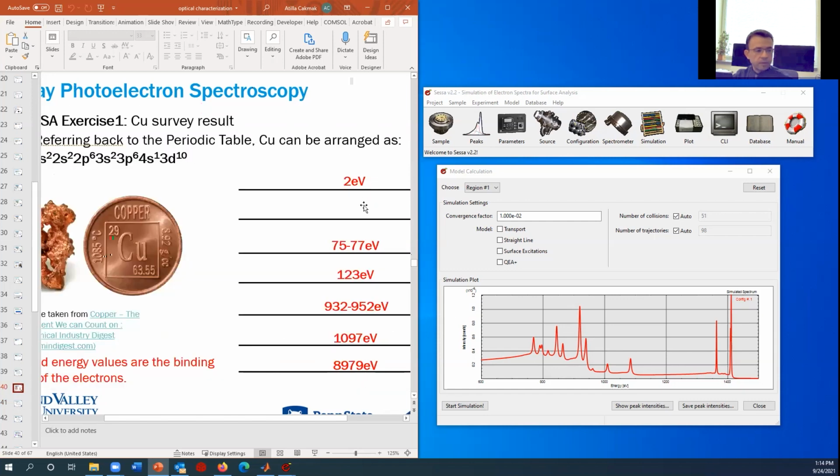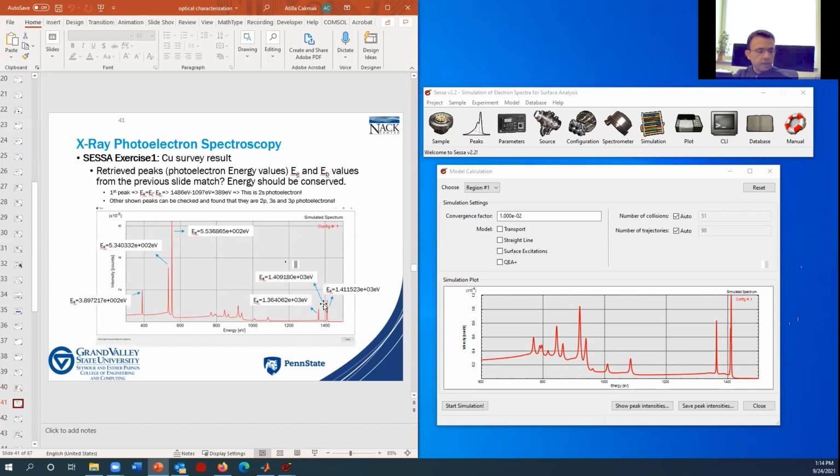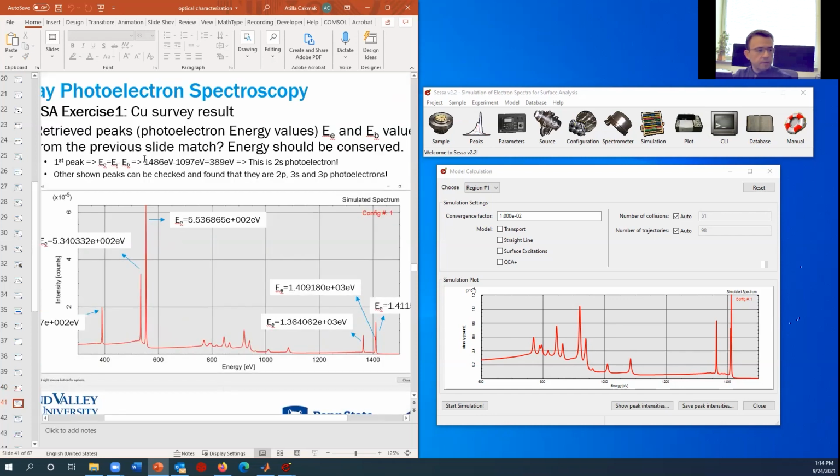Well, you can just Google that, get it from Wikipedia, etc. They're all well-known energy levels, thanks to quantum mechanics. Say we'd like to get 2p6, those binding energies, and all you need to do is put that into your EB, the binding energy value, and you know the incident energy that you're sending, you know the binding energy.